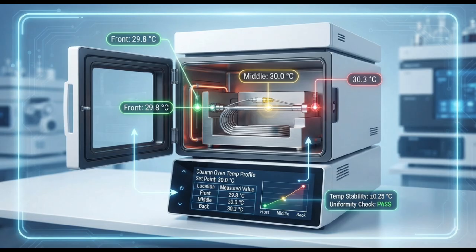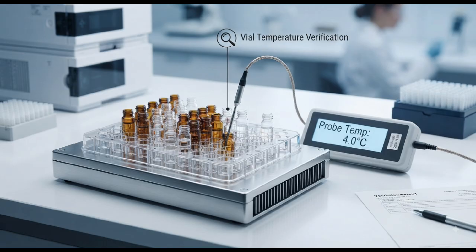Temperature mapping. In some calibration or qualification programs, temperature mapping may also be required. Multiple locations can be evaluated to understand temperature uniformity. The exact requirement depends on the equipment design, intended use, SOP, and qualification strategy. Again, always follow the approved procedure rather than applying an assumed universal acceptance limit.